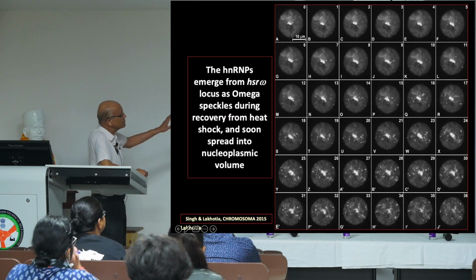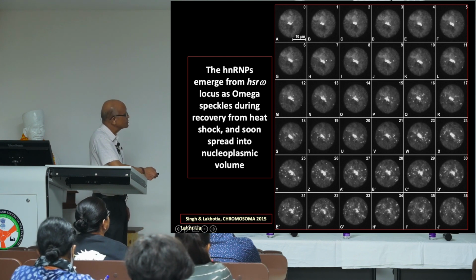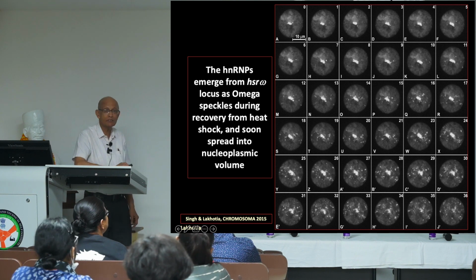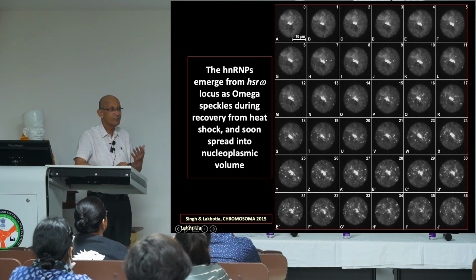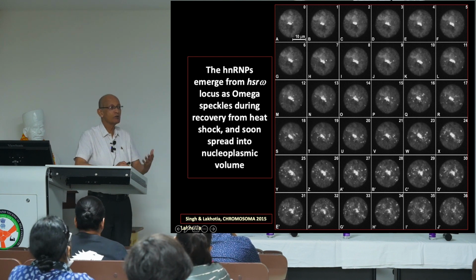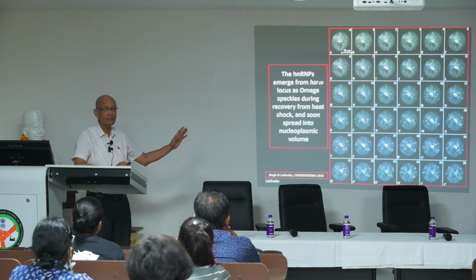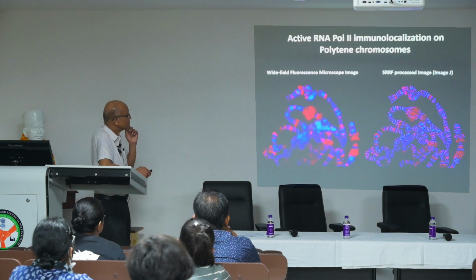Or this, when the cells recover, how from this one particular point, molecules come out every second. And you see, this gives one impression. Things in cells are really not as slow as we are slow. The cell can respond within 1 minute that temperature has gone up outside. We don't realize, but cells can, and that's something that we can record by using a live imaging system.